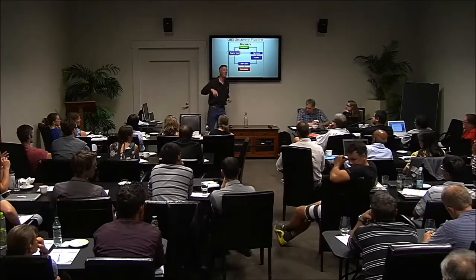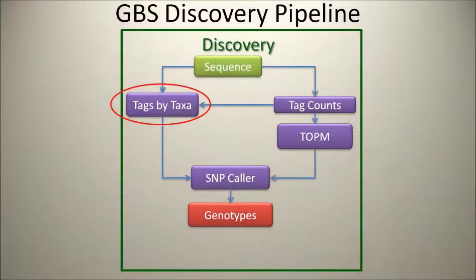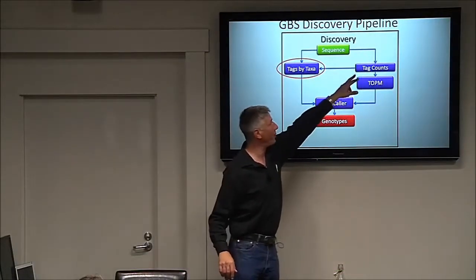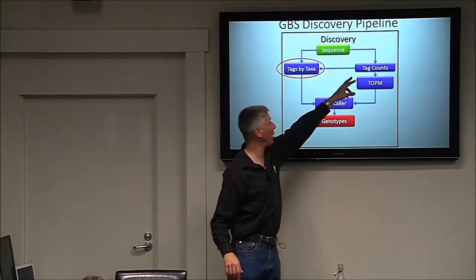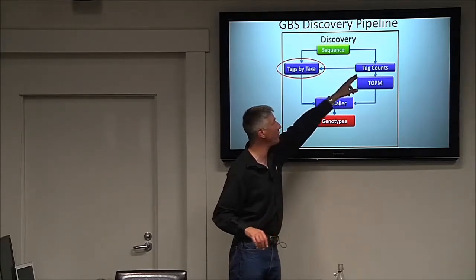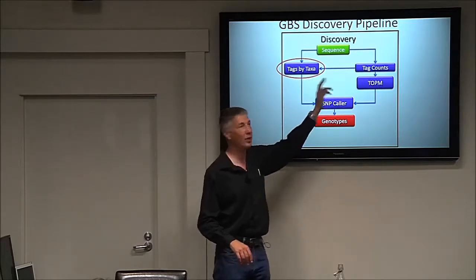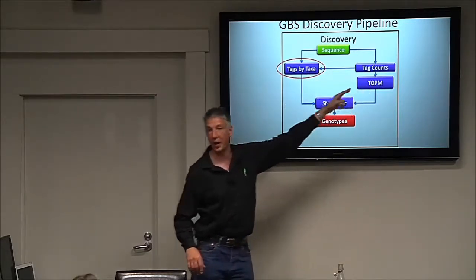Louder. That's right, a minimum tag count. Thank you, Cecilia. Minimum tag count, right? So we're going to try to exclude some of the sequencing errors at that step. So we have information in here about things that are included, and the stuff that's excluded is not there. So we use this file to inform what goes into this file, because there's no sense in putting things in here that we've thrown away at this step, right?